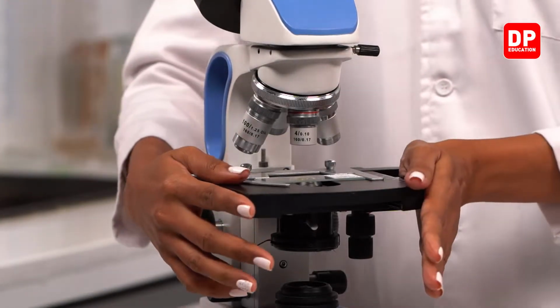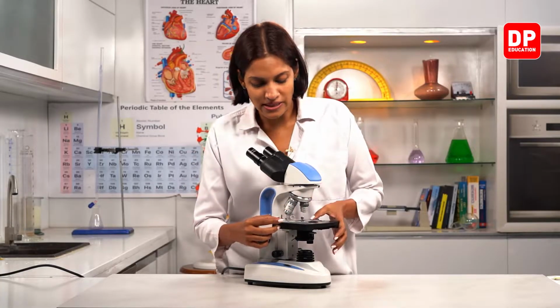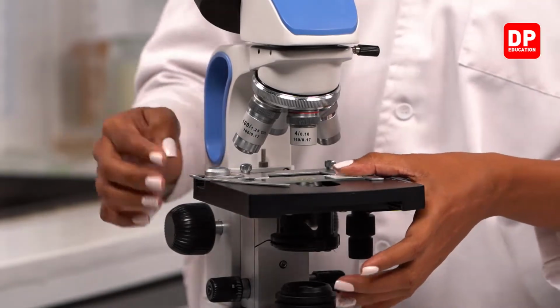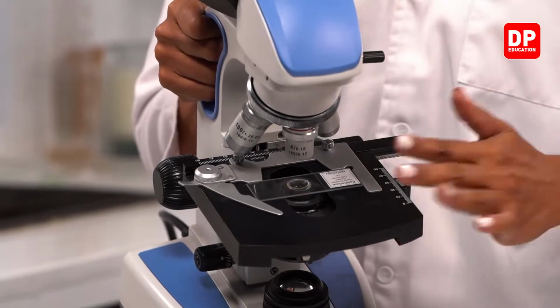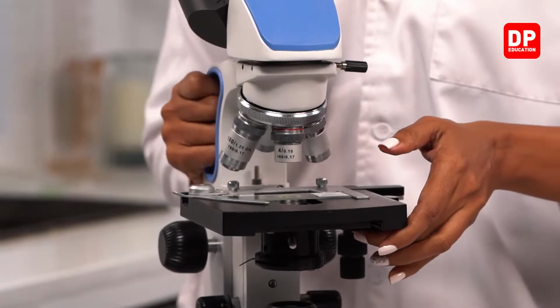In a basic microscope there are 2 stage clips on either side, but here, because this is a modern one, it's a bit different, right? You all can see here. Now it will not move here and there. It is nicely fixed on the stage. Right, children? Okay.